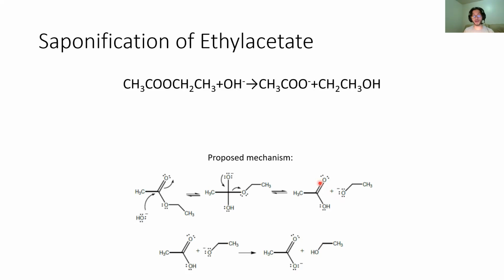So I ask again, why do we care? Well, when we have mechanisms like this, it's nice to have our sticks and our arrows and kind of just trust that, but we also want to have data and we want to be able to verify that this makes sense, right? And so we're going to do that today via kinetics. We're going to make sure that the kinetic data that we get makes sense and backs up this mechanism right here. And we'll talk about how once we get that data.